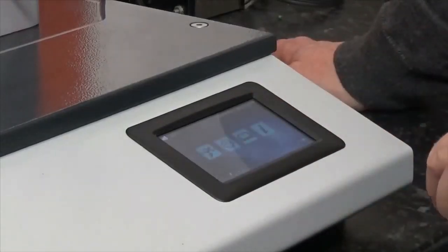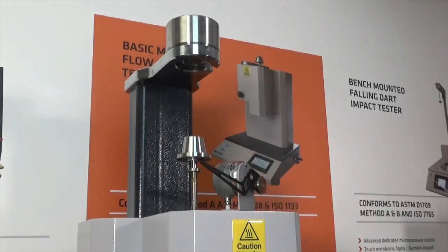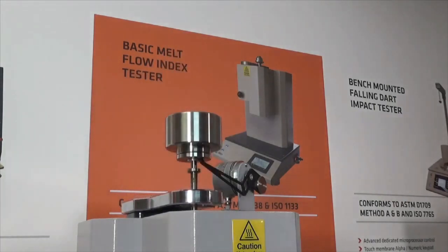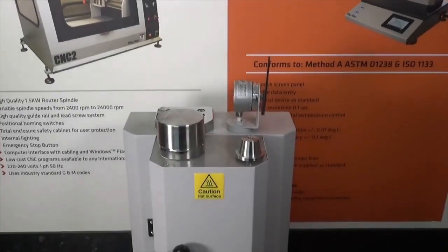The MFR300 keeps melt flow testing simple, but allows users to complete the full range of melt flow methods within a compact footprint. It represents a market-leading return on investment and is a must-have instrument for any polymer testing lab.